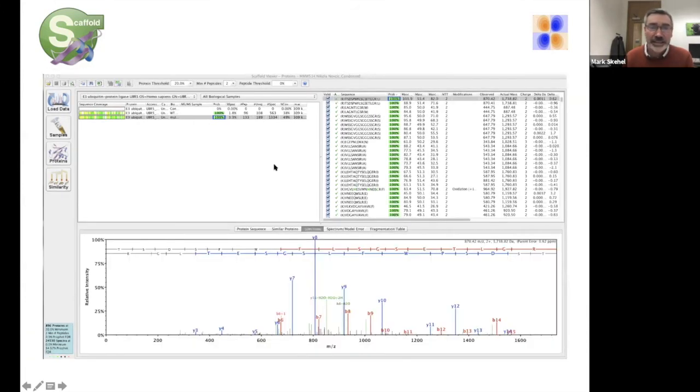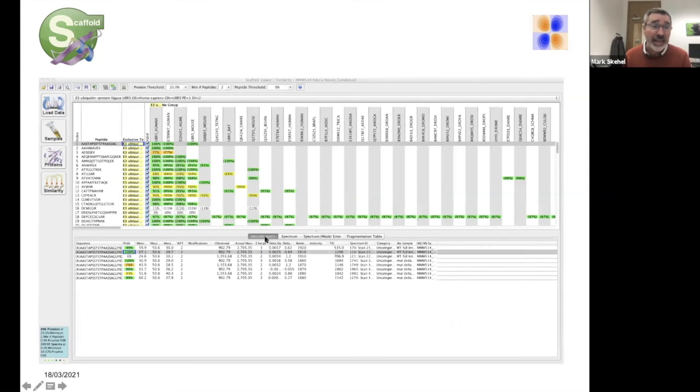And also you can dig down now by clicking on one of the peptides, and you can look at the fragmentation spectra, things that we've been looking at already, and it very nicely labels that for you. But remember always that what we're looking for is the accuracy of this precursor ion mass, and then fragmentation spectra to search the database. And if you come down to the similarity tab, you can look for proteins in different species that also would match to some of the peptides, not all of them, that you've identified for that protein. So you can identify that protein in different species.